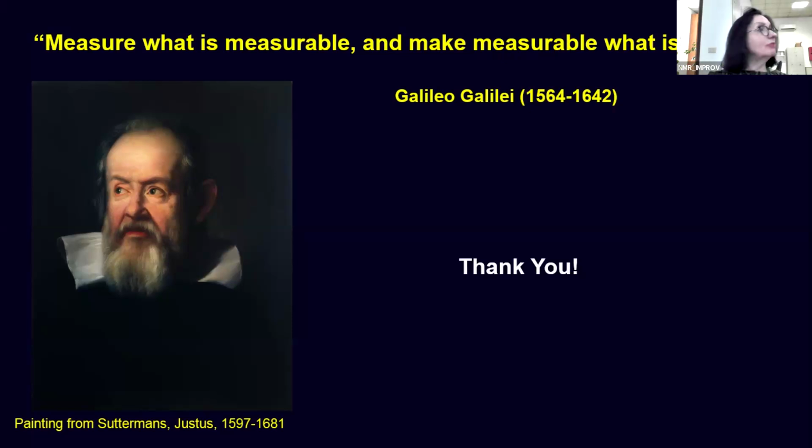Sorry, I would not really entirely agree. If I just take one data set, one profile, and the profile does not have many characteristic features, I would be more worried not about the accuracy of the fit, whether I find a local minimum or global minimum, but rather about the model which I use.